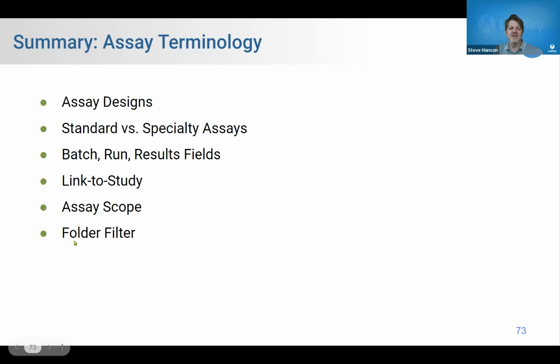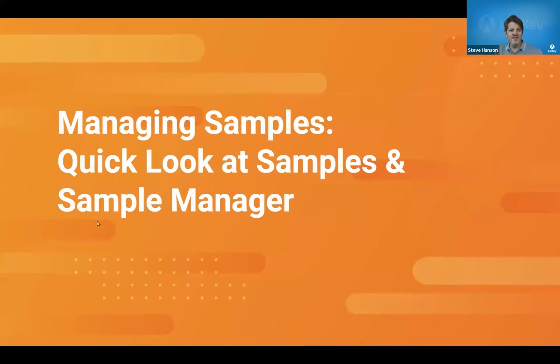Also, assay scope and folder filter. Do you understand these concepts? This took me a while to understand. I'm going to give you another chance to understand this tomorrow as well. Anyways, that's my presentation on assays. If you have questions, put them in the chat. And let's have a little interlude and quickly look at samples and Sample Manager. I just want to do 5 or 10 minutes, and we'll take a break.